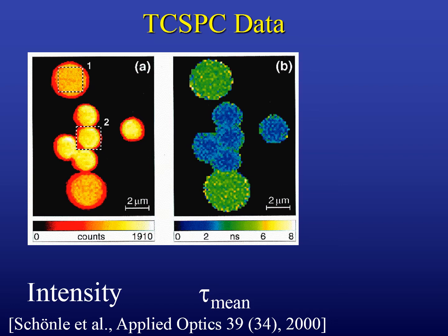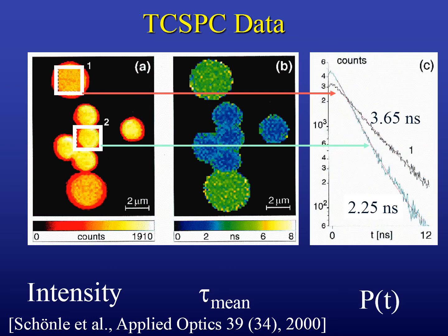This is maybe one of the strongest points: fluorescence lifetime is essentially completely independent of intensity. So you avoid confusion by brightness changes because you're looking at an inherent property of the dye, which is its fluorescence lifetime decay curve. You can then plot this again in a logarithmic plot. If it's a purely mono-exponential decay, you would expect a nice straight line in such a semi-logarithmic plot.